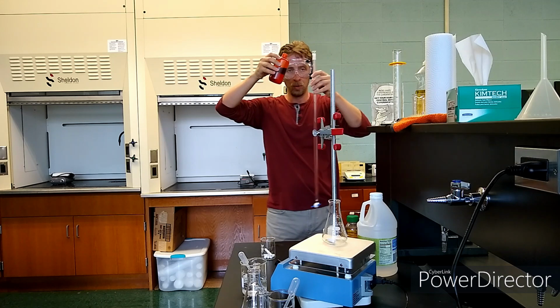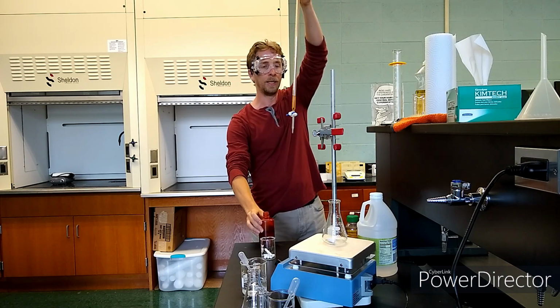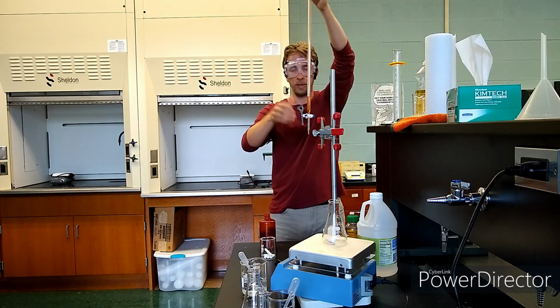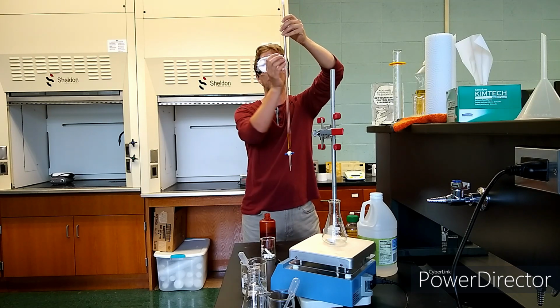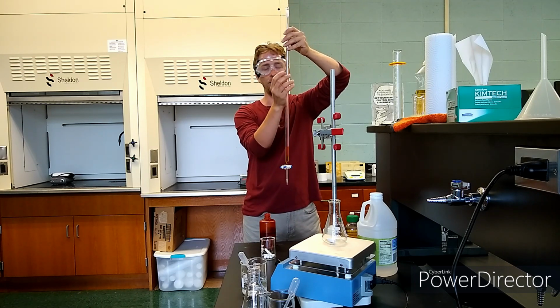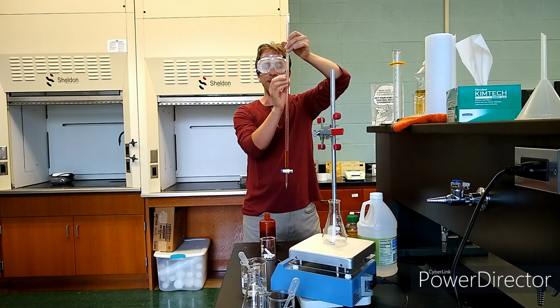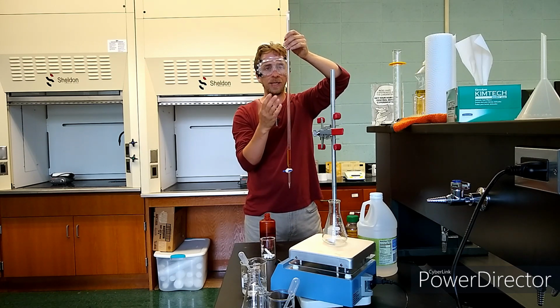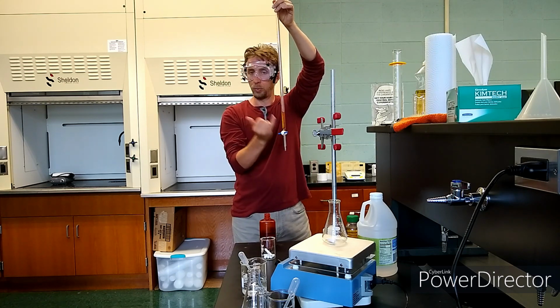So here we go. Just want a few milliliters in there. That's plenty. Now this is what I like to do as well, and different people do this different ways, but I don't like to fill the burette all the way up. Around the inner walls of the burette, there can be contaminants, and water droplets could be one of those contaminants, and that could dilute your solution when you pour it in the burette.